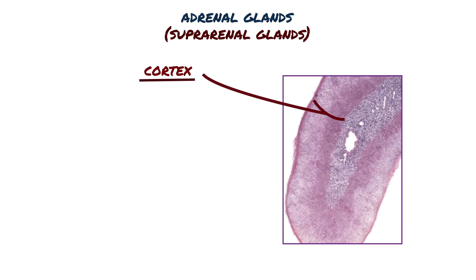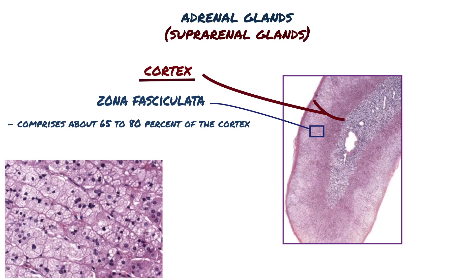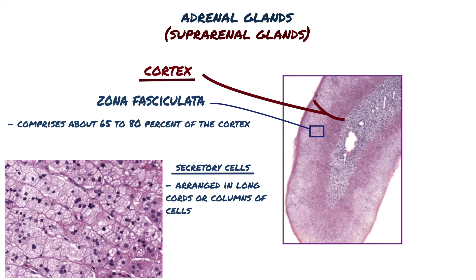Moving deeper into the adrenal gland, the zona fasciculata is the largest of the three zones and comprises about 65–80% of the cortex. Instead of clusters of cells like those in the zona glomerulosa, the secretory cells in this layer are arranged in long cords or columns of cells, often just one to two cells thick, aligned perpendicular to the surface of the adrenal gland. These cells have a larger amount of lipid-filled cytoplasm that results in a lighter stain and a foamy appearance.